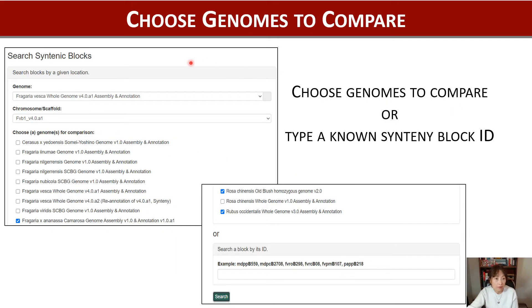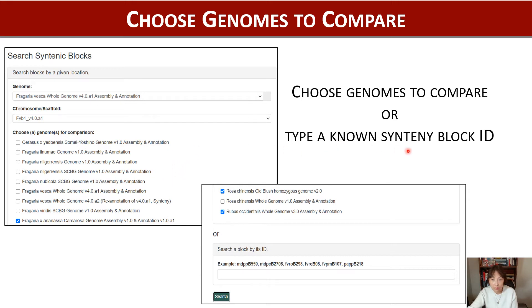On the home page of Synteny Viewer, you can choose one reference genome and a chromosome, and then choose multiple genomes for comparison. Also, you can type a known synteny block ID here.